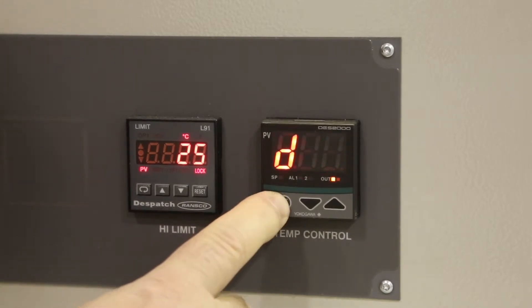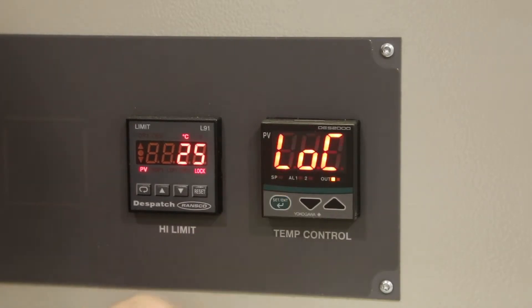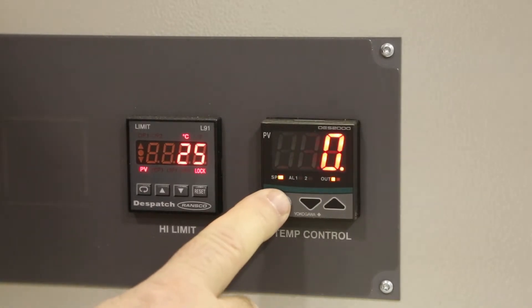Then cycle the green button until LOC is displayed. Press the down arrow to change the value to zero and press the green button.